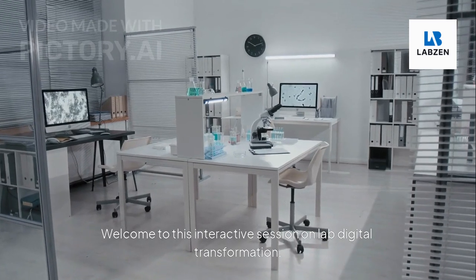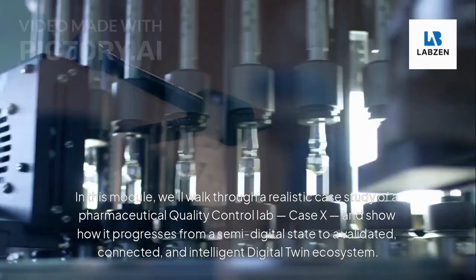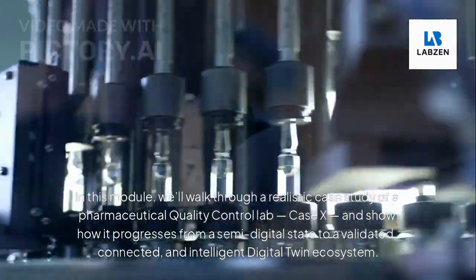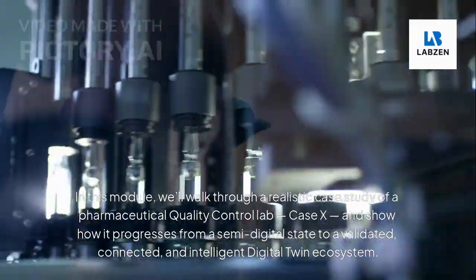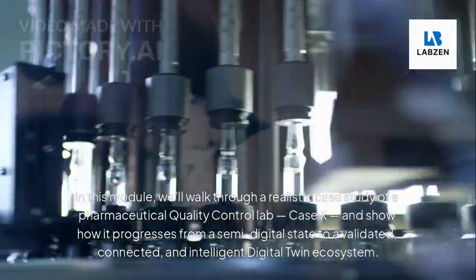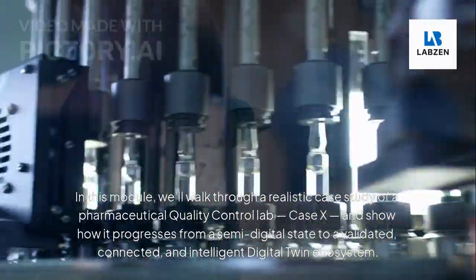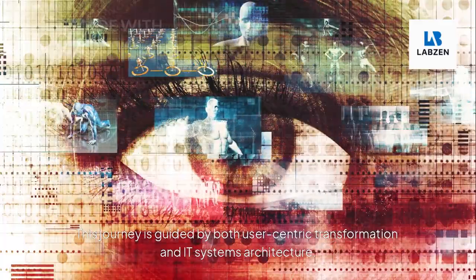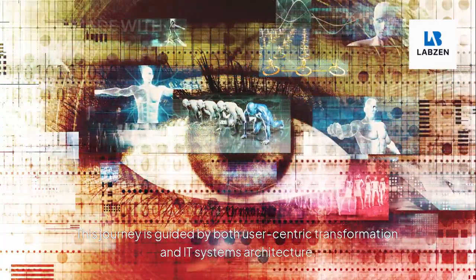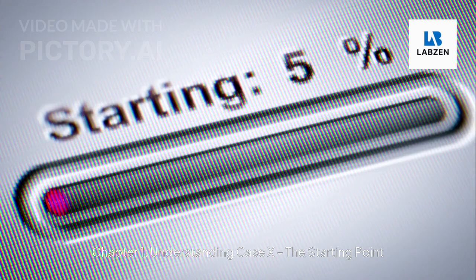Welcome to this interactive session on lab digital transformation. In this module, we'll walk through a realistic case study of a pharmaceutical quality control lab, Case X, and show how it progresses from a semi-digital state to a validated, connected, and intelligent digital twin ecosystem. This journey is guided by both user-centric transformation and IT systems architecture. Let's begin. Chapter 1: Understanding Case X.